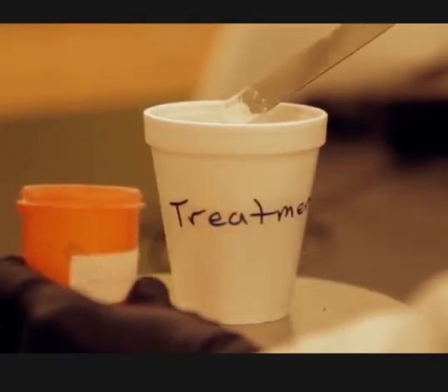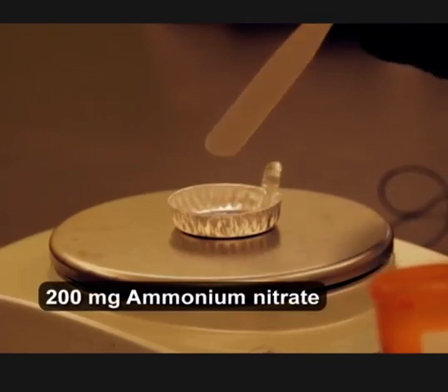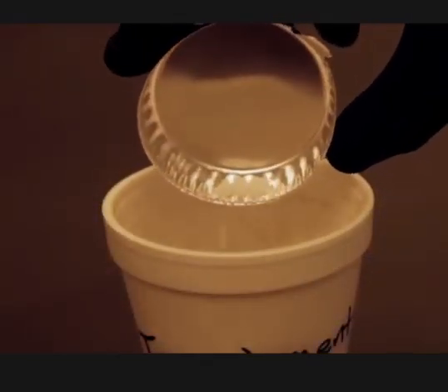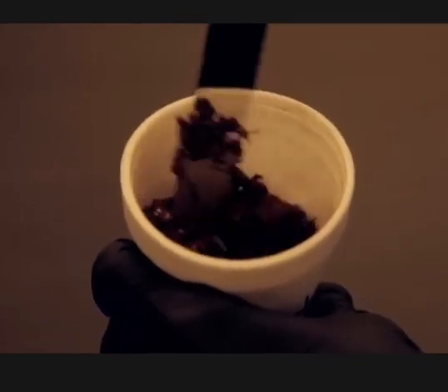Weigh this amount of glucose and add it to the treatment container only. Weigh 200 milligrams of ammonium nitrate, then add it to the treatment container only. The ammonium nitrate serves as the nitrogen nutrient source for the soil microbes. Mix the soil, glucose, and ammonium nitrate mixture in the container.